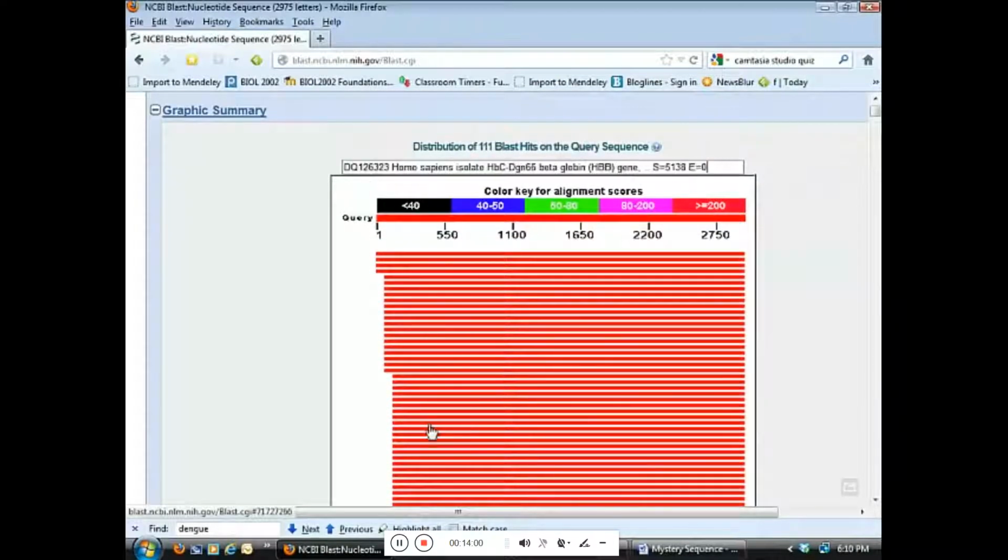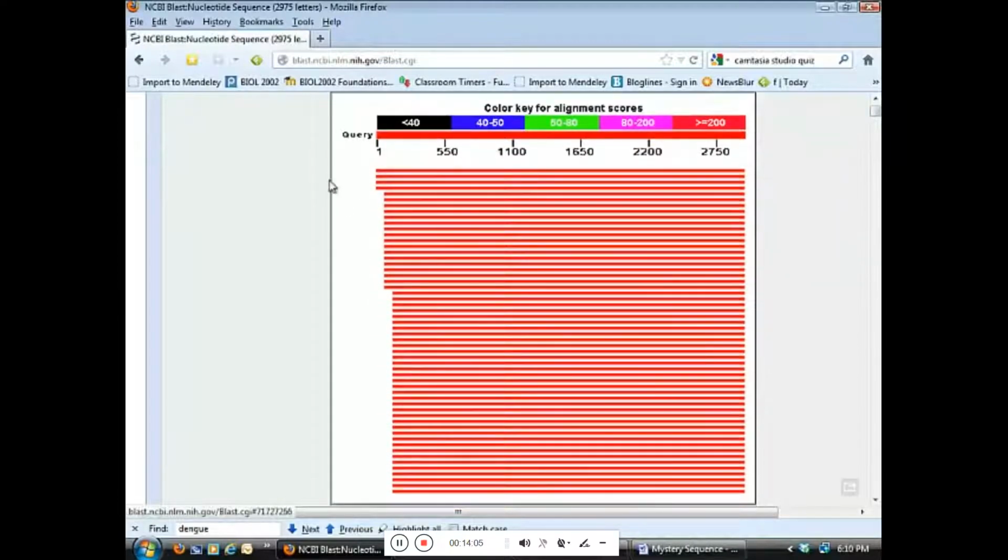There's an orangutan one in here. I'm not really seeing them right now, but they are in here, depending on how the search is done and how much sequence you've used. If you use less sequence, you probably get more hits to unrelated things like other primates.